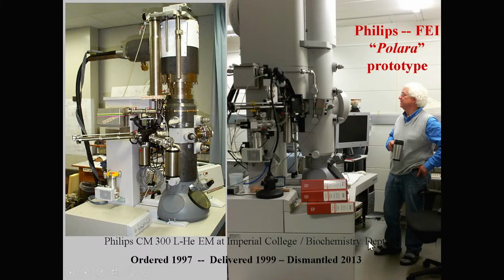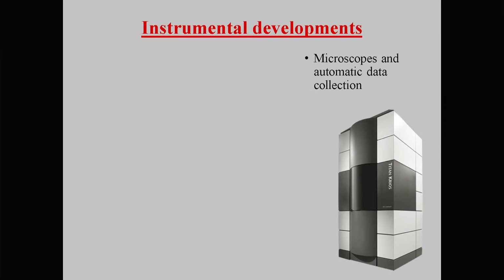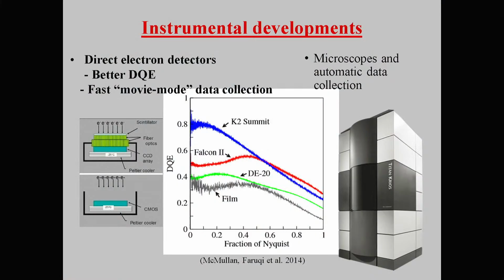in 2013. I was already in Leiden then, and in Leiden there were the two fantastic Cryo microscopes, and this is Sasha Di Carlo operating the microscope. It was a new world for me to have this type of microscope where you could count the electrons that came in. And here, fantastic new cameras. DQE, I'll come back to DQE. You pay a lot of money for DQE.